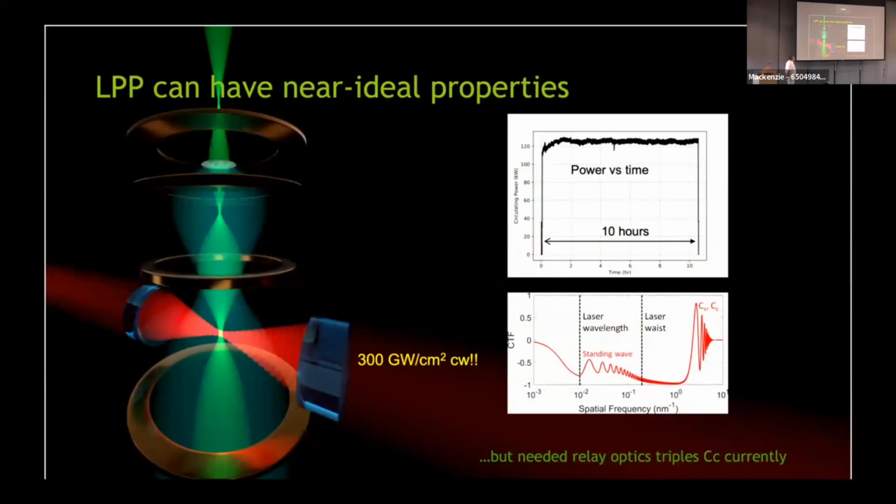So the idea was to integrate into the microscope column a Fabry-Perot cavity of extremely good quality to build up a 10-watt laser 10,000-fold, to turn it into a 100-kilowatt laser, recycling the laser beam, right? One of the advantages is that the 10-watt laser is not going to cut a hole into the expensive electron microscope.